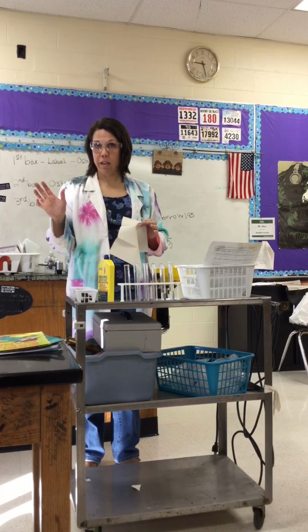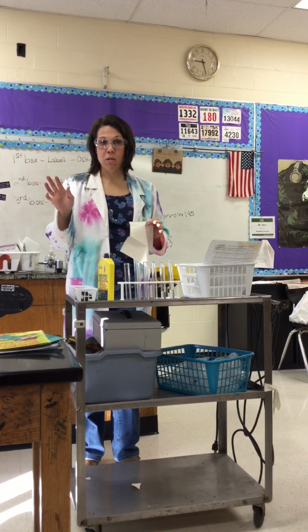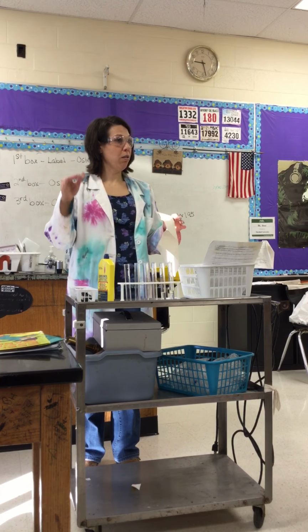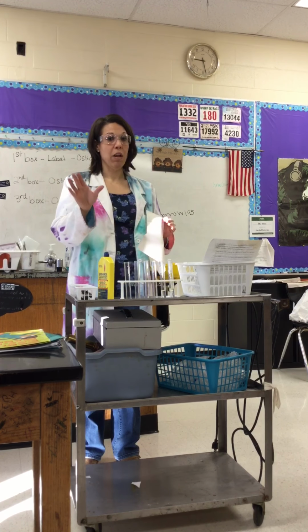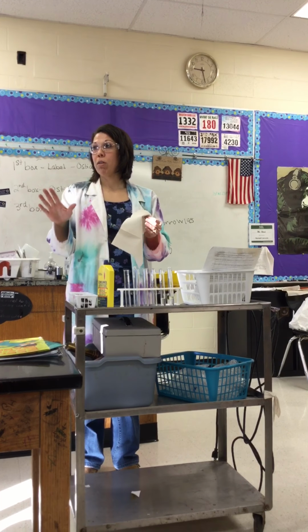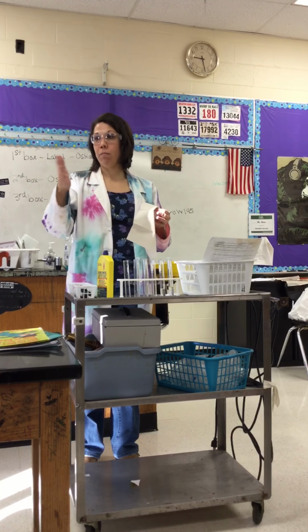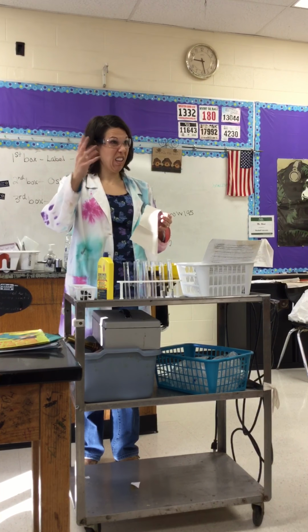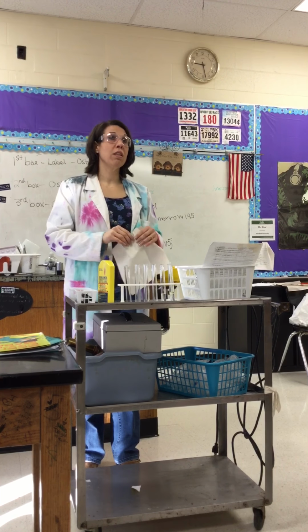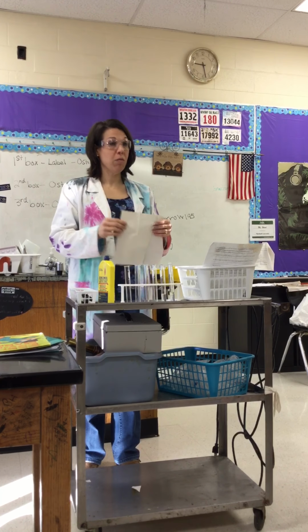It gets greasy. When you've eaten all your pizza and you have the pizza box left, the pizza box is dry, but those grease spots still look wet. They're stained, right? So the same premise is what we're going to do today.